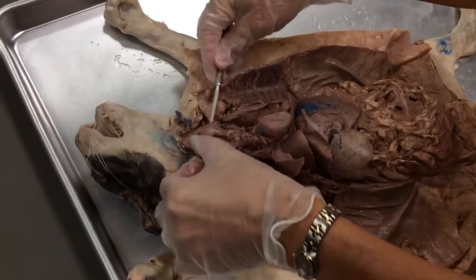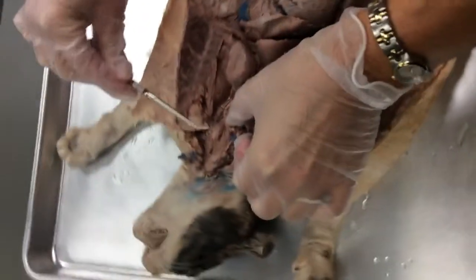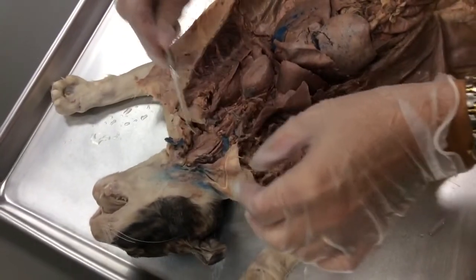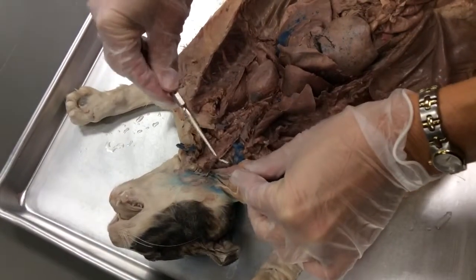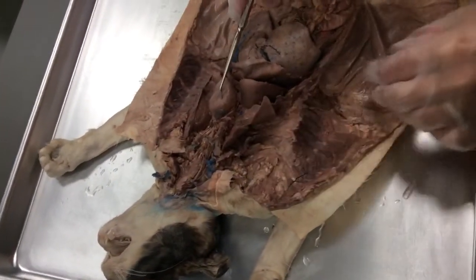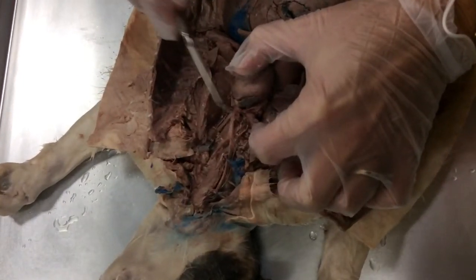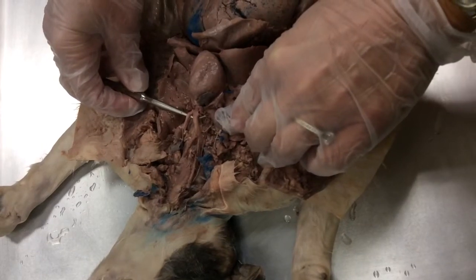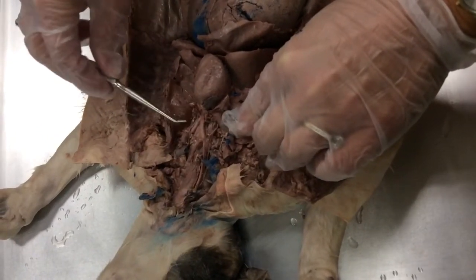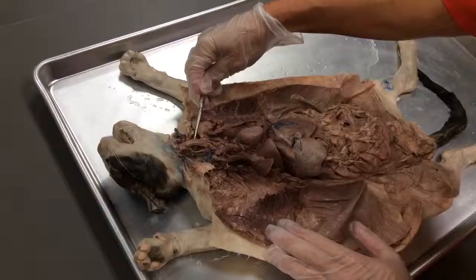What is this? Esophagus. Yeah, and they cut open theirs, so I'll have one that looks a little bit better. They went into it. I don't know if you could see that. So esophagus, and what is this artery? Common carotid. Very good. What is this? Heart. And this is the arch of the aorta. It's right next to the heart, and there's two vessels off of it. Brachiocephalic and the subclavian. Yep. Which is the left subclavian. So left subclavian and brachiocephalic. Okay.